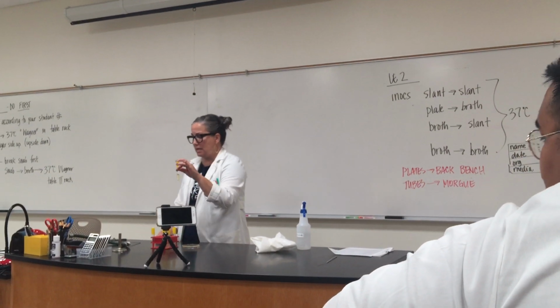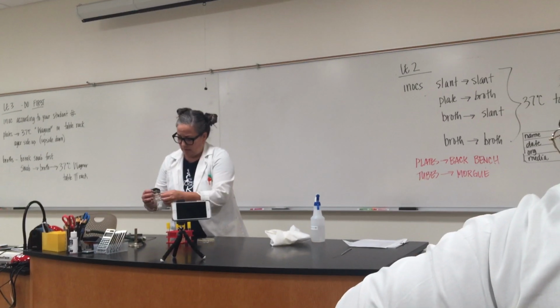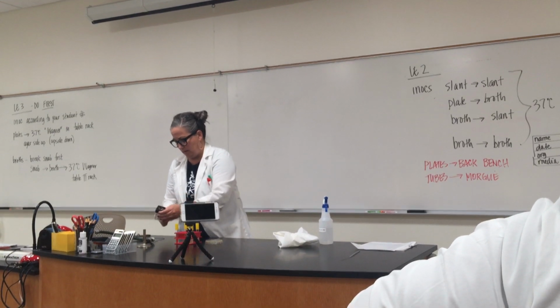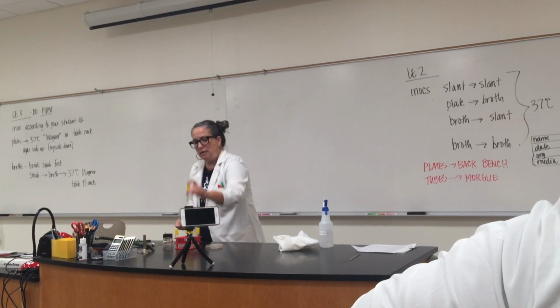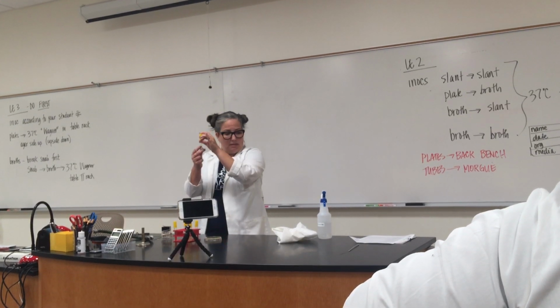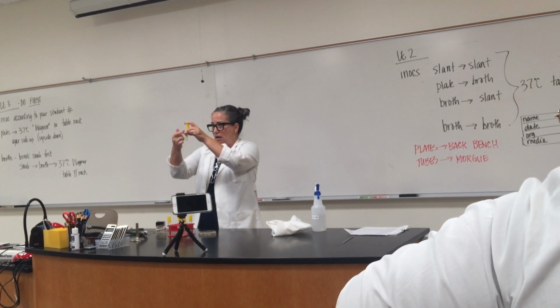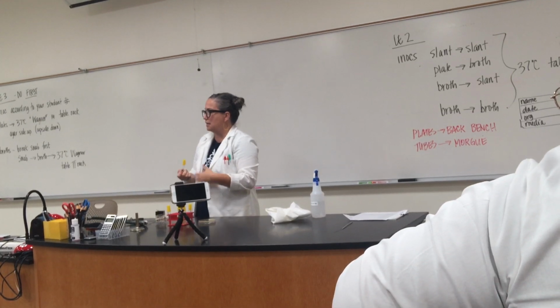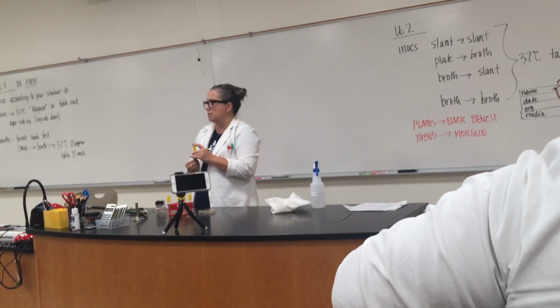And right when we're taking and putting, you might have noticed that I went over and I threw away all the big rubber bands, because I think big rubber bands are a really bad idea when you're doing this kind of stuff, because big rubber bands you have to wrap around multiple times, right? Try to keep this upright, which is awkward. So you're going to wrap a piece of paper around it, and then you have to go like this and hold it upright and make your hands really awkward. But if you tilt it, you're going to tilt organism all over your hands, and then you have to start all over again, and we have to decontaminate you, which is not a huge deal, but you have to wash, and we have to do stuff.